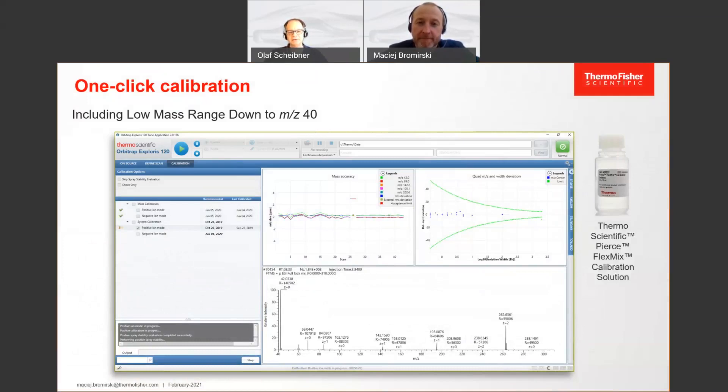So you infuse it once, and then you can run the positive calibration first and just immediately after, without any hassle, you can run the negative calibration the same way. But even more, we have added another item to the calibration routine: we really calibrate down to the lowest masses. The instrument now scans down to m/z 40, and mass accuracy at these very small masses is a very critical point. So with these new instruments, we changed the calibration routine — as an extra point, we have the low-mass calibration.